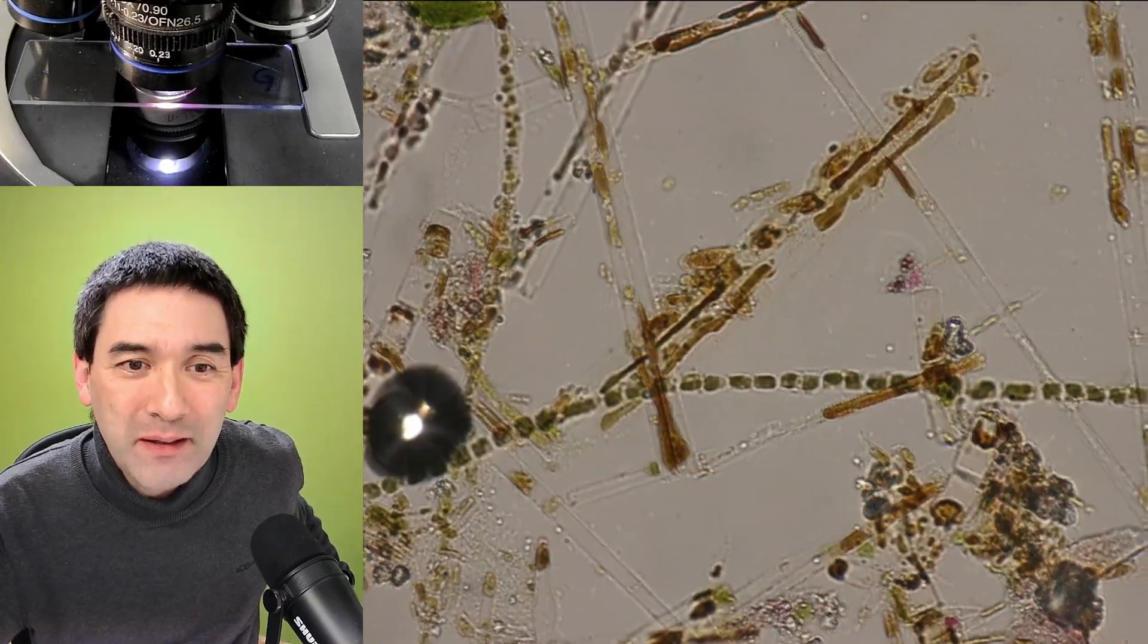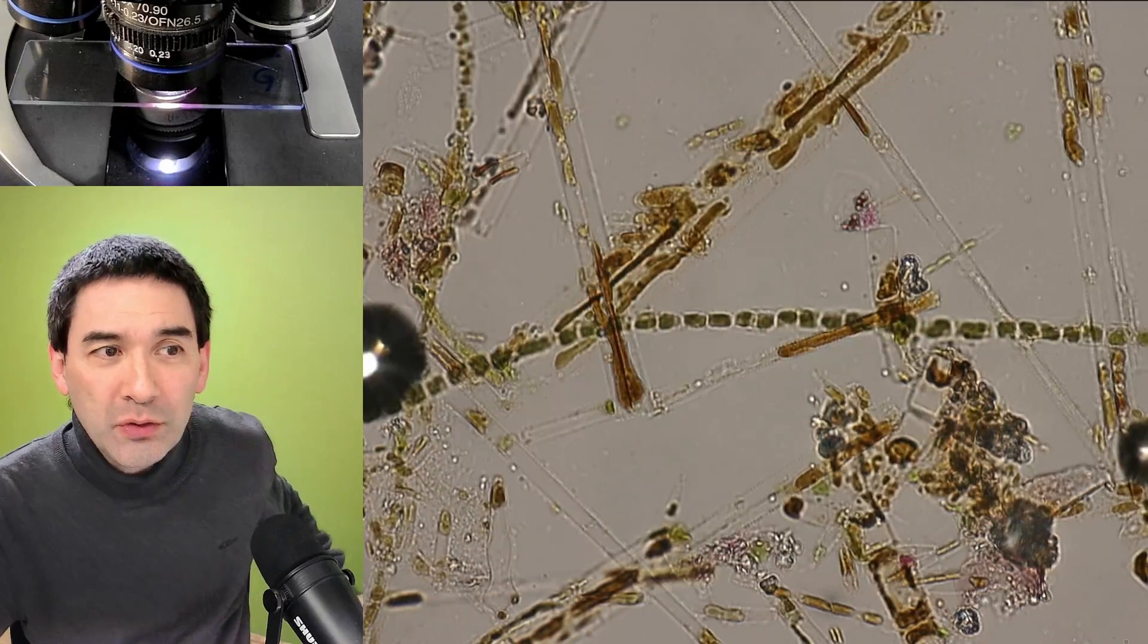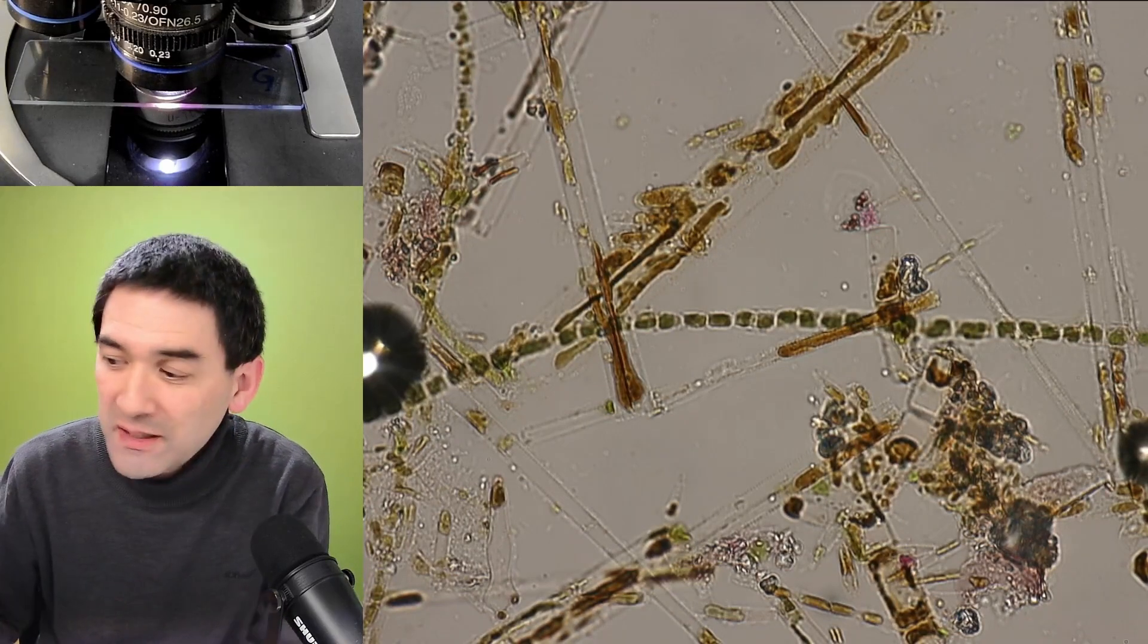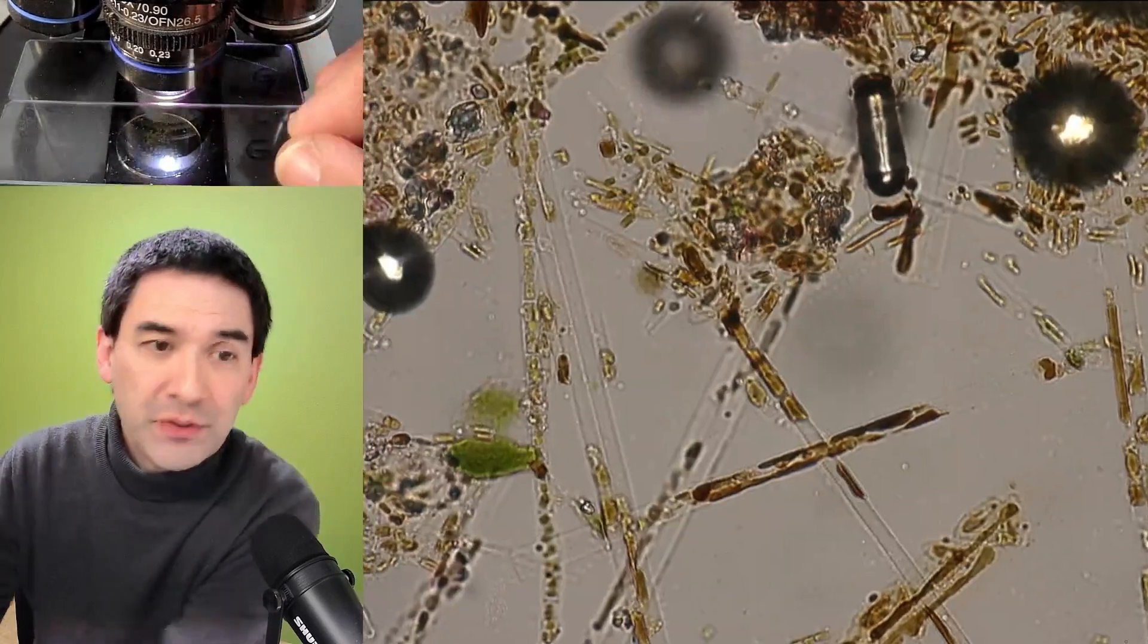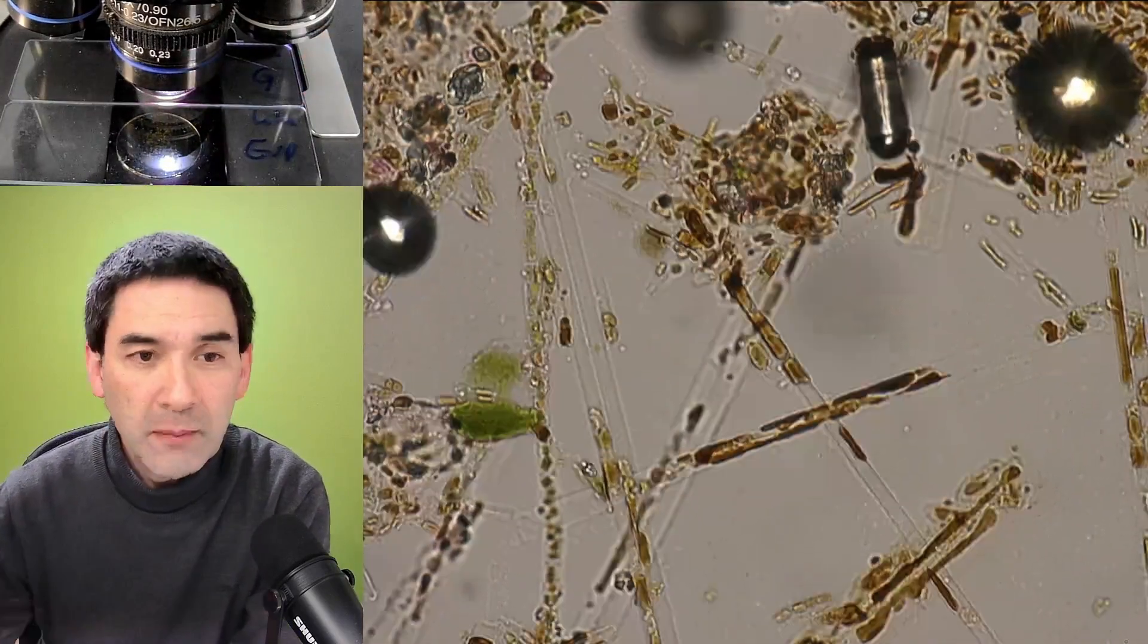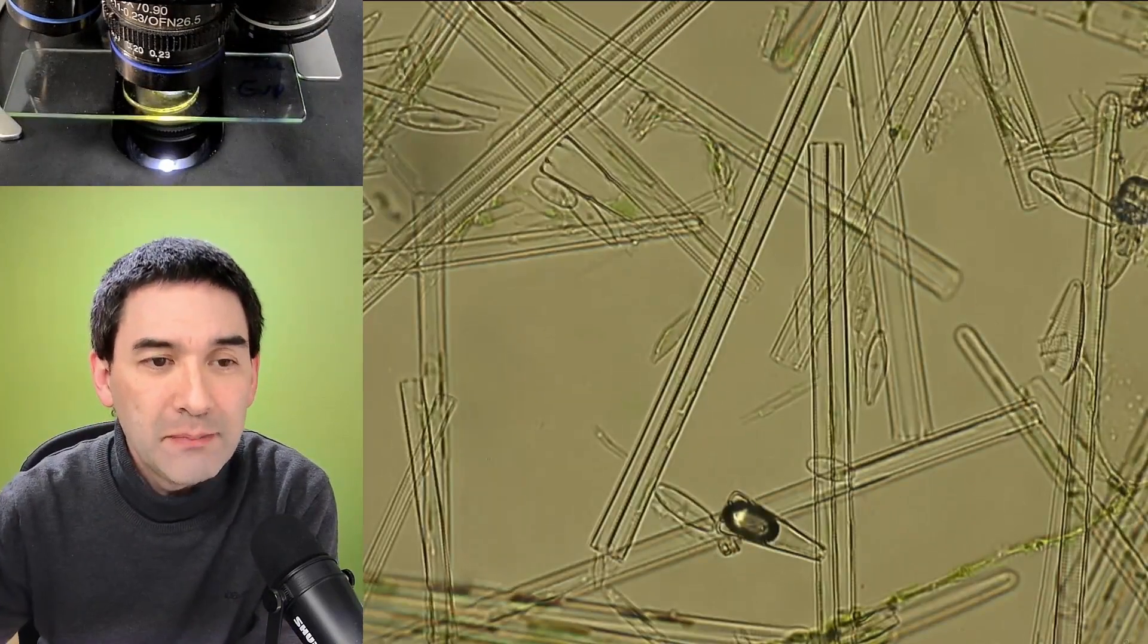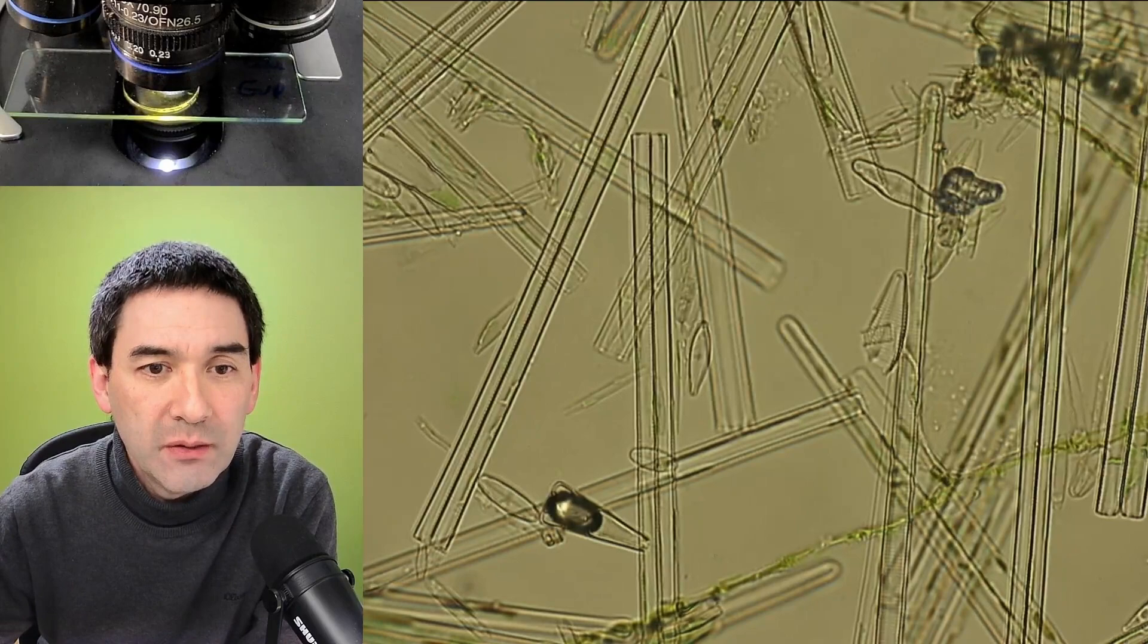What I'm going to do now is add to the stage the same specimen but now mounted in Eupro mounting medium. Let's have a look how that looks like. Okay, so that is now mounted in Eupro, same specimen, and we can already see quite a big difference here, right? Look how the diatoms look.